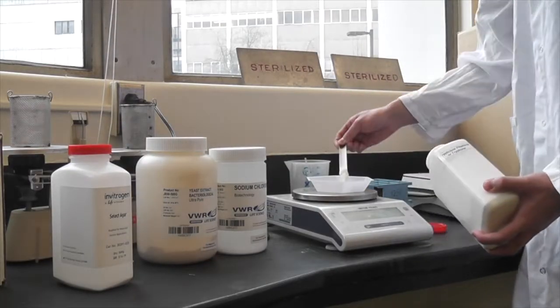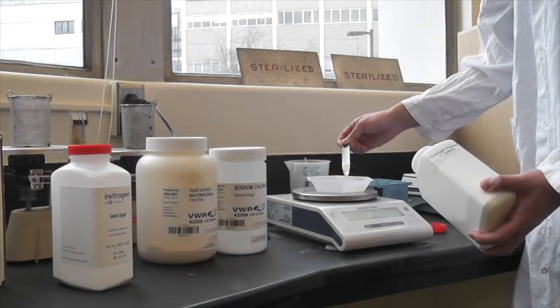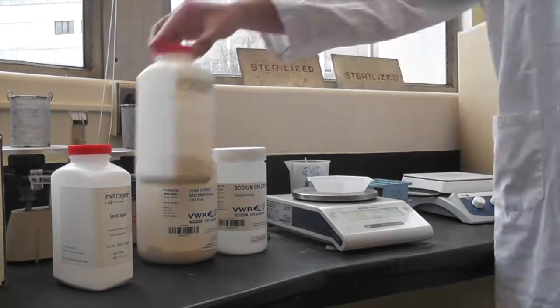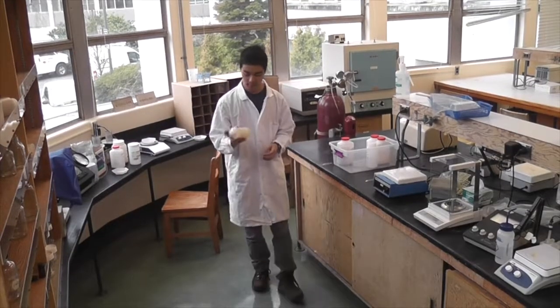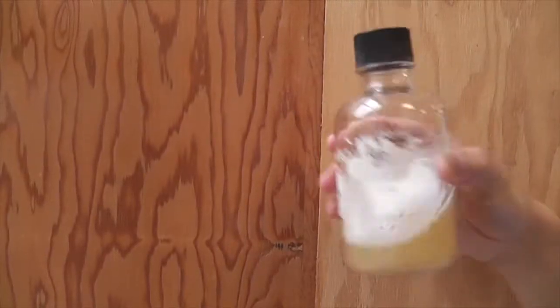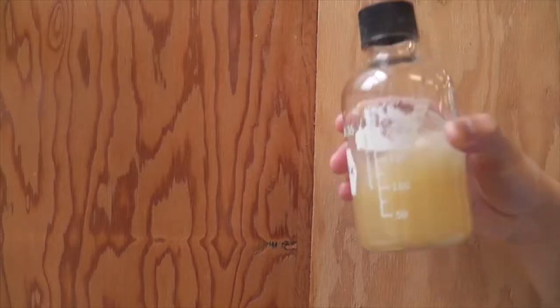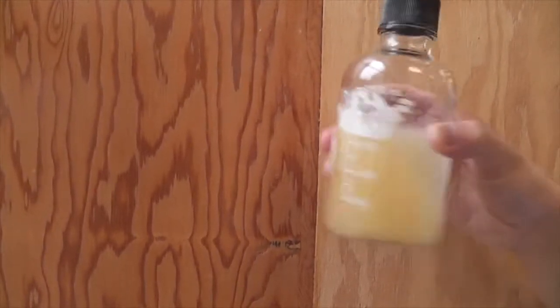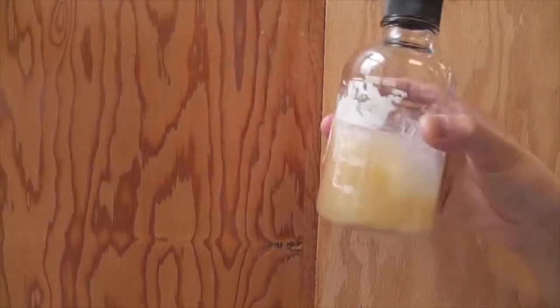First, weigh out and mix together all the ingredients required to make your desired media in a bottle that can be autoclaved. Next, add the correct amount of distilled water to the bottle and mix thoroughly. Ensure there are no clumps of dry material remaining in the bottle. The media is now ready to be autoclaved.